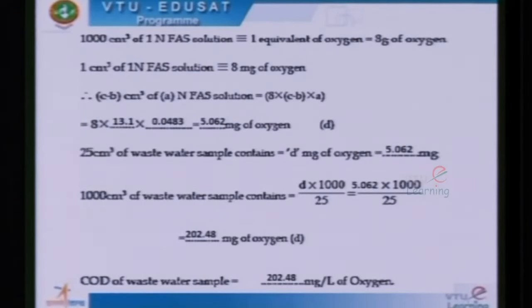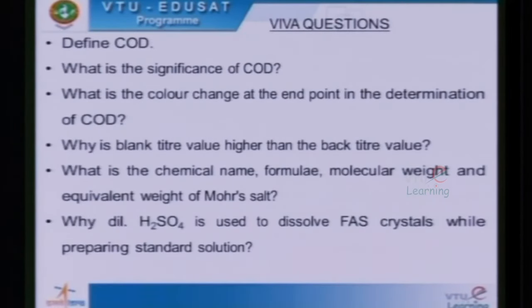The COD of the wastewater sample is found to be 202.48 milligram per liter of oxygen. The viva questions are as follows.